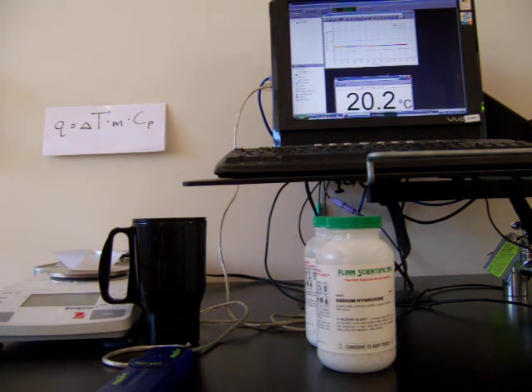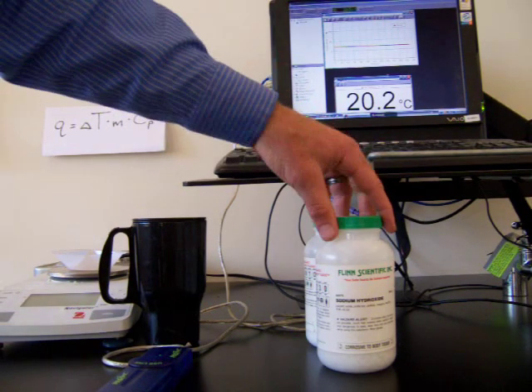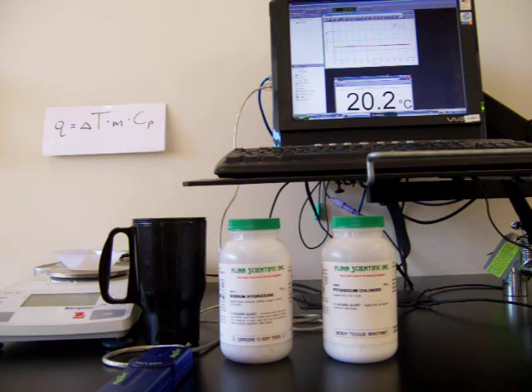This is the heat of solution lab where we're going to find the heat of solution of two different salts. We're going to be working with sodium hydroxide and potassium chloride today, two different ionic compounds. We're going to be determining their heat of solution.